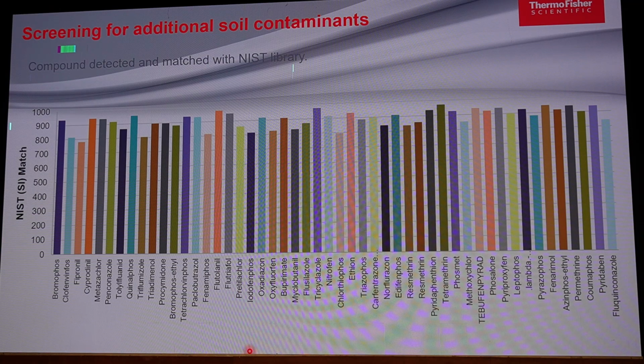You can see that this is a certified material which can give you confidence about the matching with the NIST library and the NIST score. You can see how the NIST score matches, almost more than 80%, 90%. And that NIST library is not the exact mass, accurate mass; it is a unique mass which you are using for single quad or triple quad systems. The same library has been used here, and based upon that algorithm it will calculate the result's accurate mass, plus it will provide you the mass accuracy also.